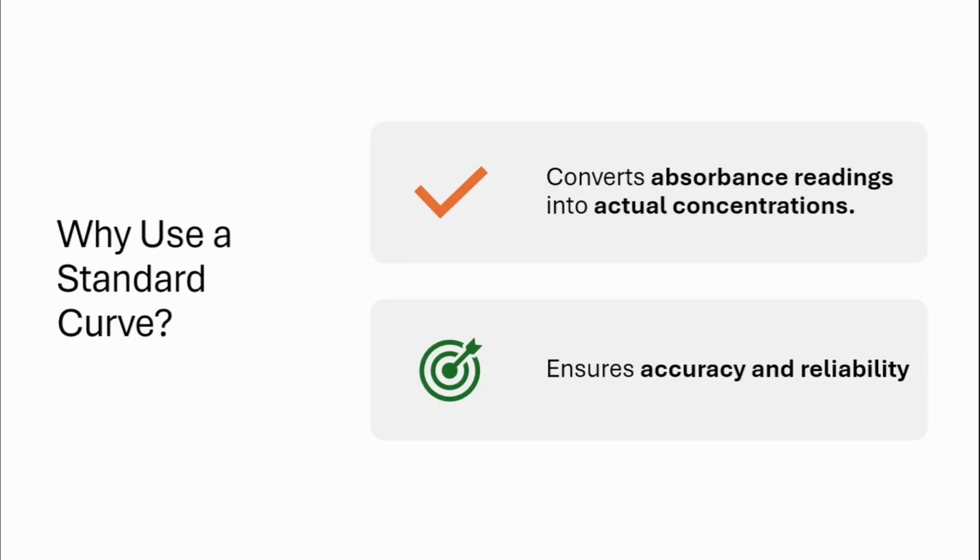Why do we use this? Because we convert absorbance readings into actual concentration. It ensures accuracy and reliability.